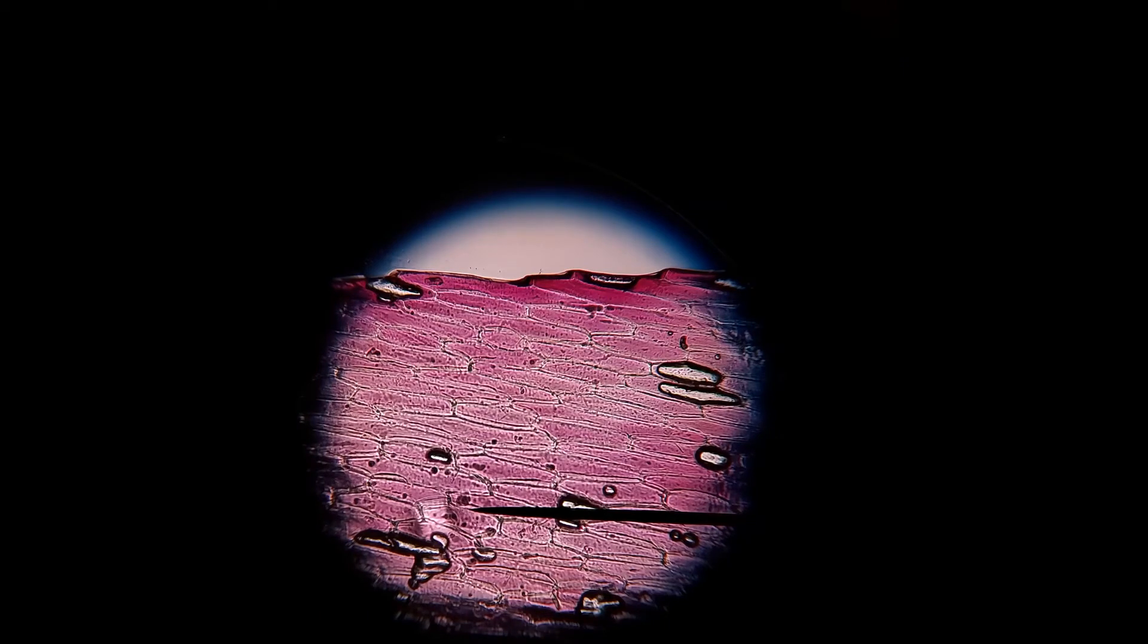Now this is in pure water, and water is going into the cells, which makes the cell membrane fully pushed against the cell wall. And hence we see all these beautiful cells looking as cells ought to. What happens next?